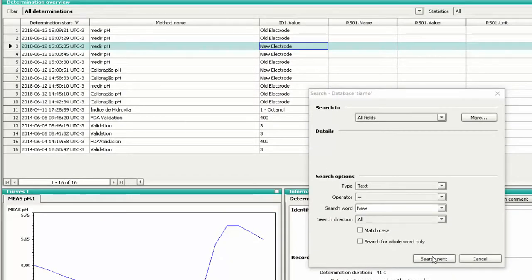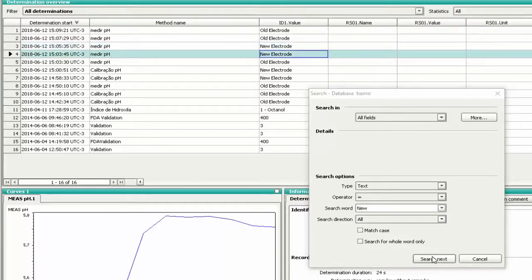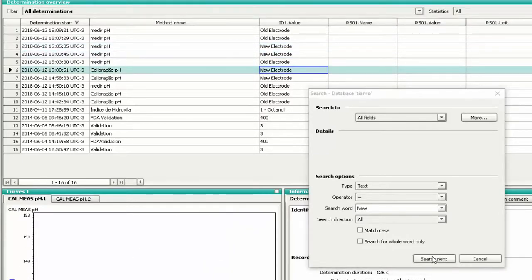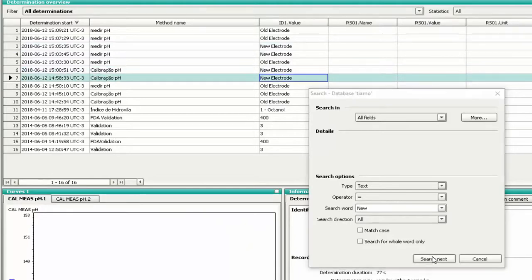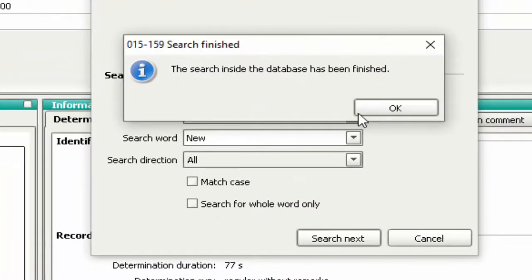Notice in the database that an analysis that has this word is highlighted. Press Search Next again and see that the next line is highlighted in the database. If there is no more data with this word, the search will be finished.